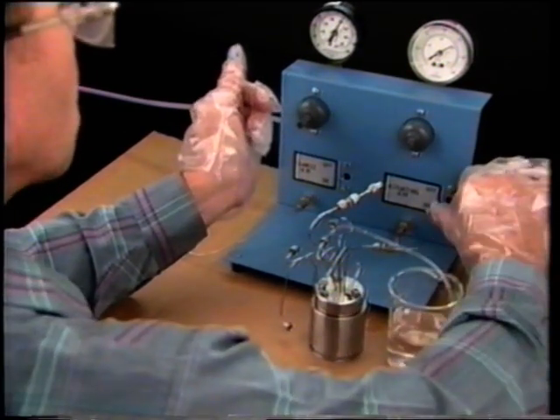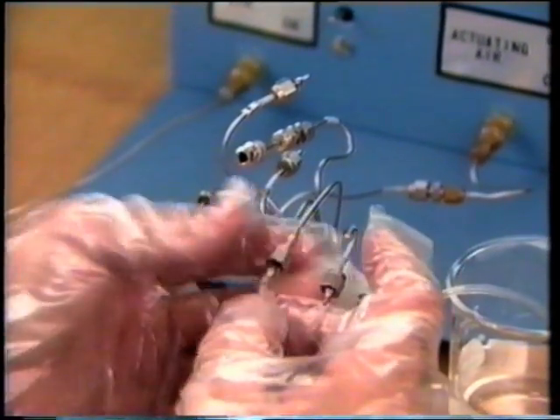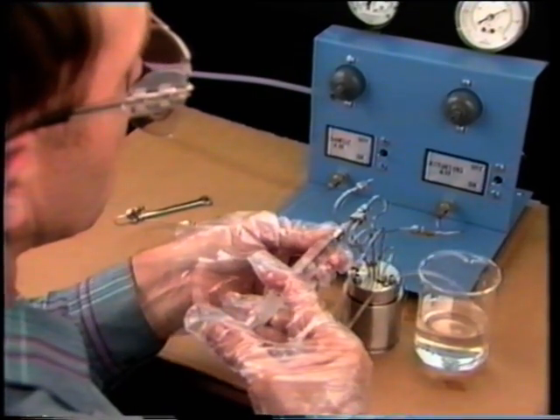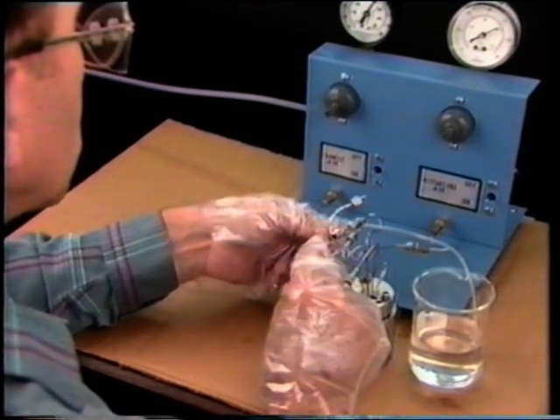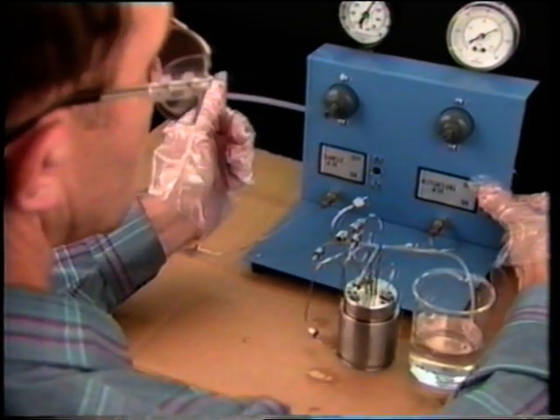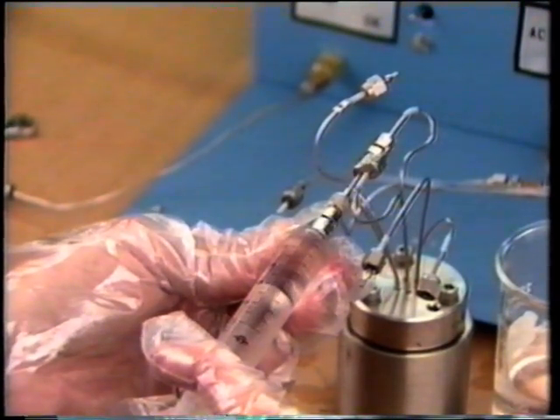Remove the air pressure. Attach the syringe to port 5 and place the tubing between port 6 and the container of fluid. Force fluid through the passage between ports 5 and 6. Now attach one end of the tubing to port 4 with the other end placed in the container of fluid. Use air pressure to switch the valve. Force fluid through the passage between ports 5 and 4.